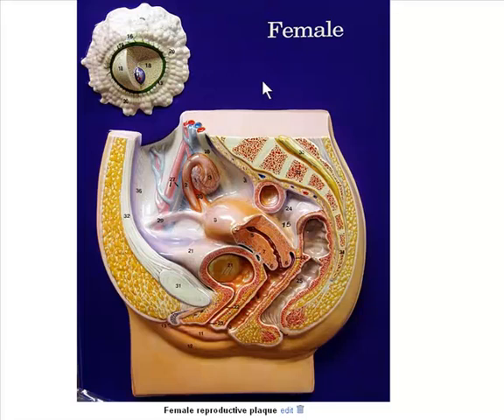In this section, we're going to go through some of the models having to do with the reproductive system as well as some of the reproductive histology. Starting with some of the activity plaques, we can see that, as commonly with these, we've got both a macroscopic section and a microscopic section. So as you're going through and doing the reproductive anatomy, make sure that you're paying attention to the microscopic anatomy.